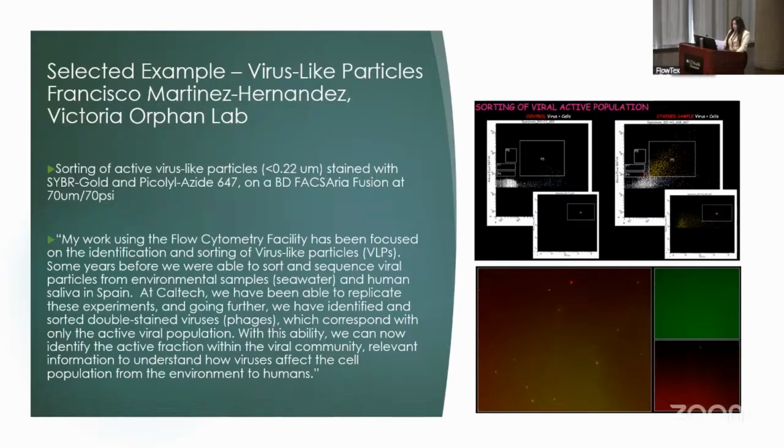So the idea for current experimentation, very broadly, is to understand community dynamics, characterize previously unknown species, and examine their relationships to situations like climate change, disease, and more. So instrument sensitivity is important to obtain the most representative sample that the existing technology will allow and ensure that as many viruses as possible are detected since they are found at or near the limit of detection.